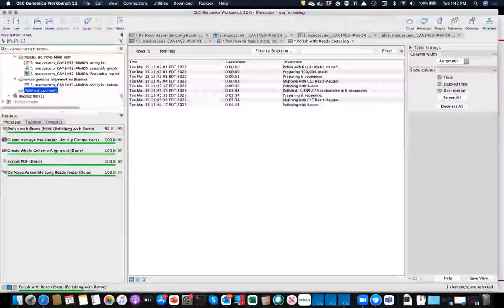Well, I normally wouldn't run this as one step and then the next tool. So it depends. I'm trying to understand the question. If it is to take long and short reads and do them in one assembly, I would suggest not to do that. If I had Illumina data and Ion Torrent or PacBio data, I would be using these 2 different tools.